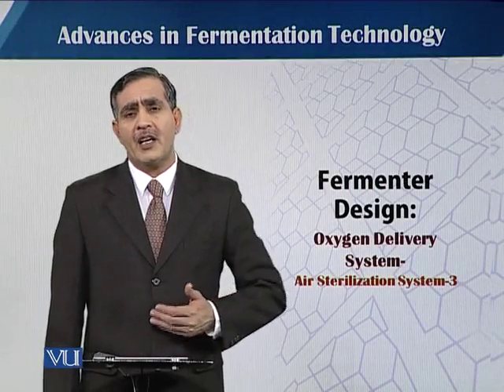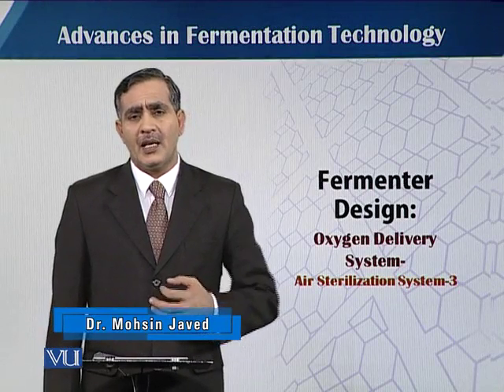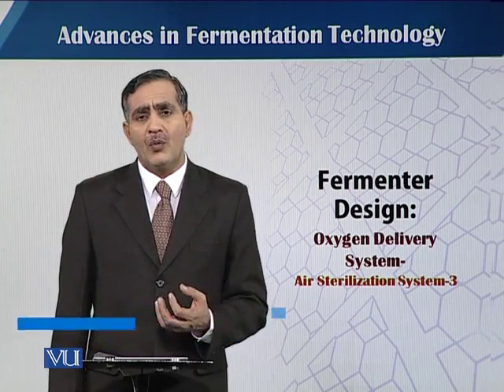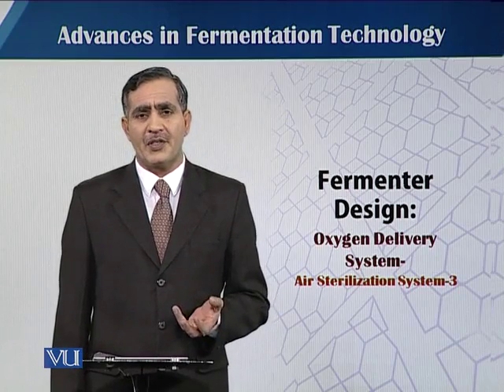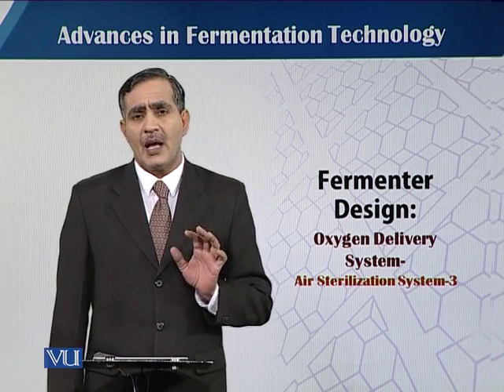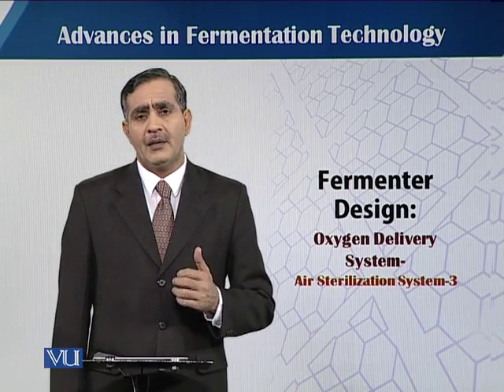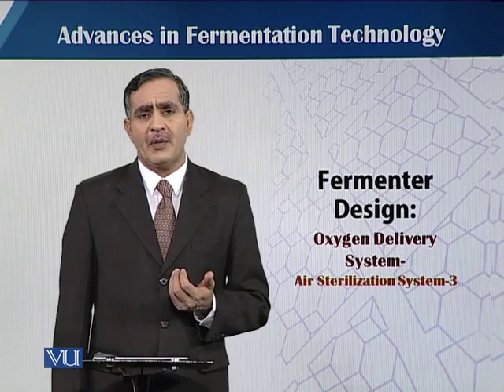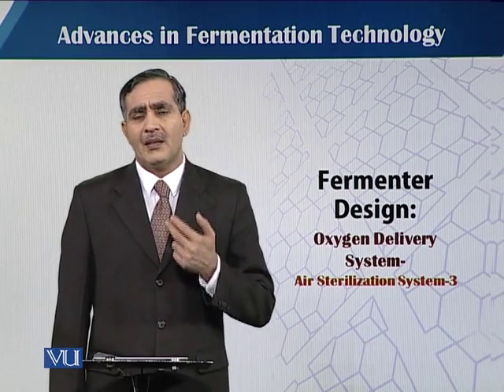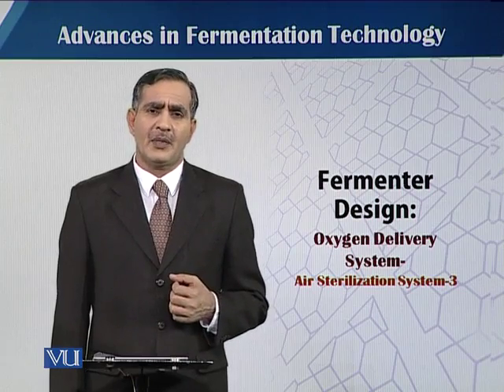In this module, we will talk about the role of the oxygen delivery system in aseptic operation of the fermentation process. How can we maintain aseptic operation? We must ensure that the air entering the fermentation vessel is properly sterilized, and that the air exiting the fermentation vessel is properly free from those organisms which we cultured inside the vessel.